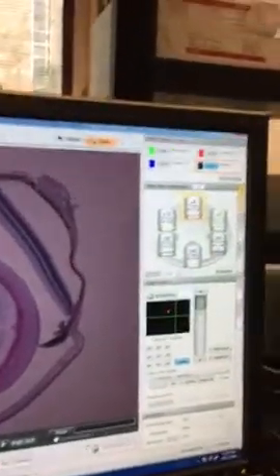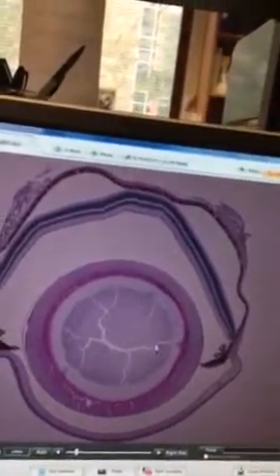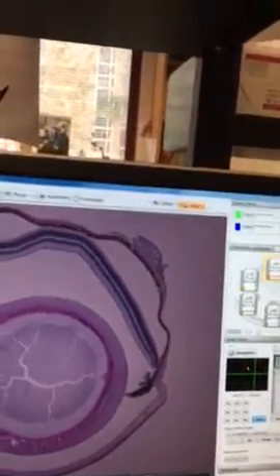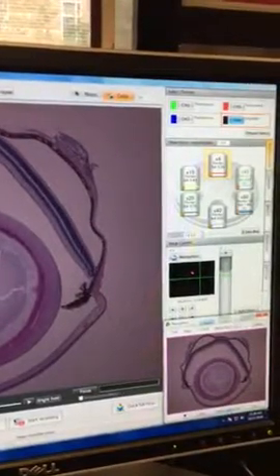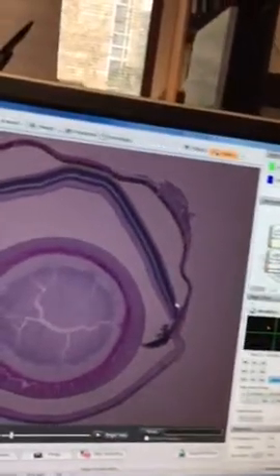First, hit... You've got your... Make sure you've got preview going, or nothing else works. You want to go to navigation and do the image registration. Then you can close that. Once you got yourself a 4x image, you should be all set.